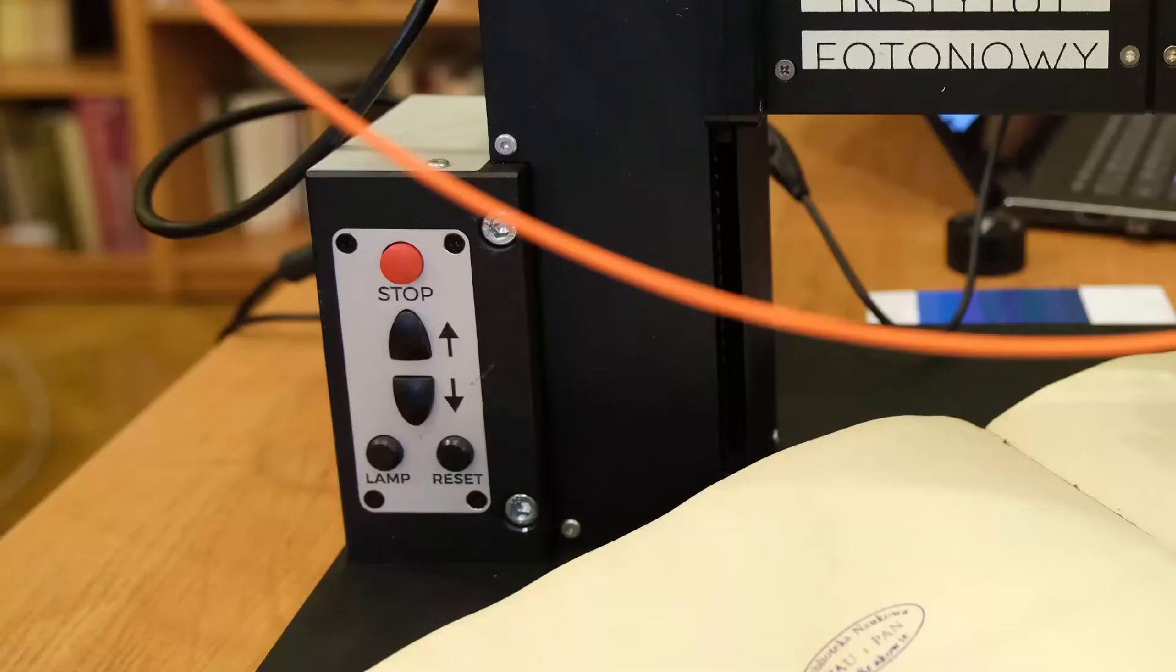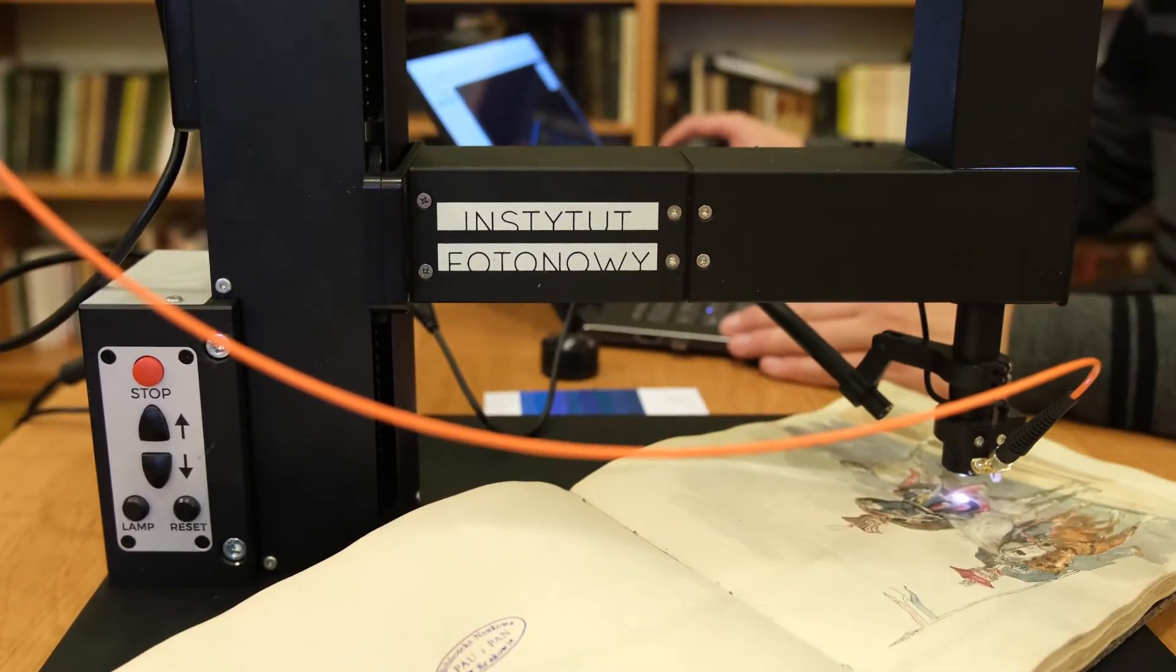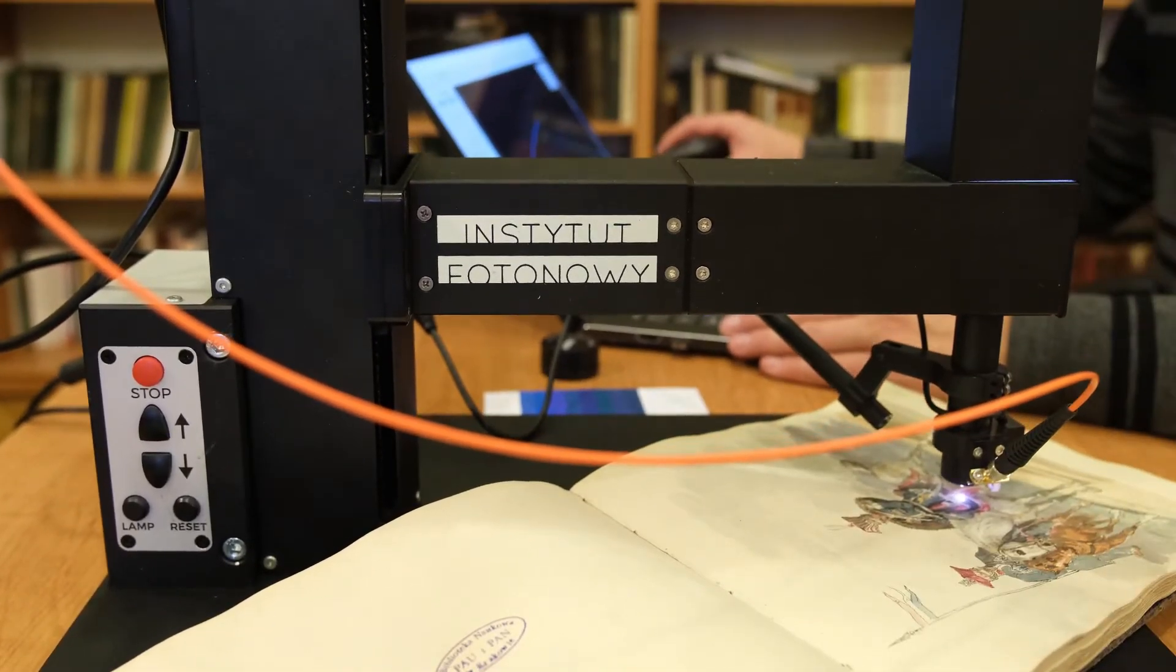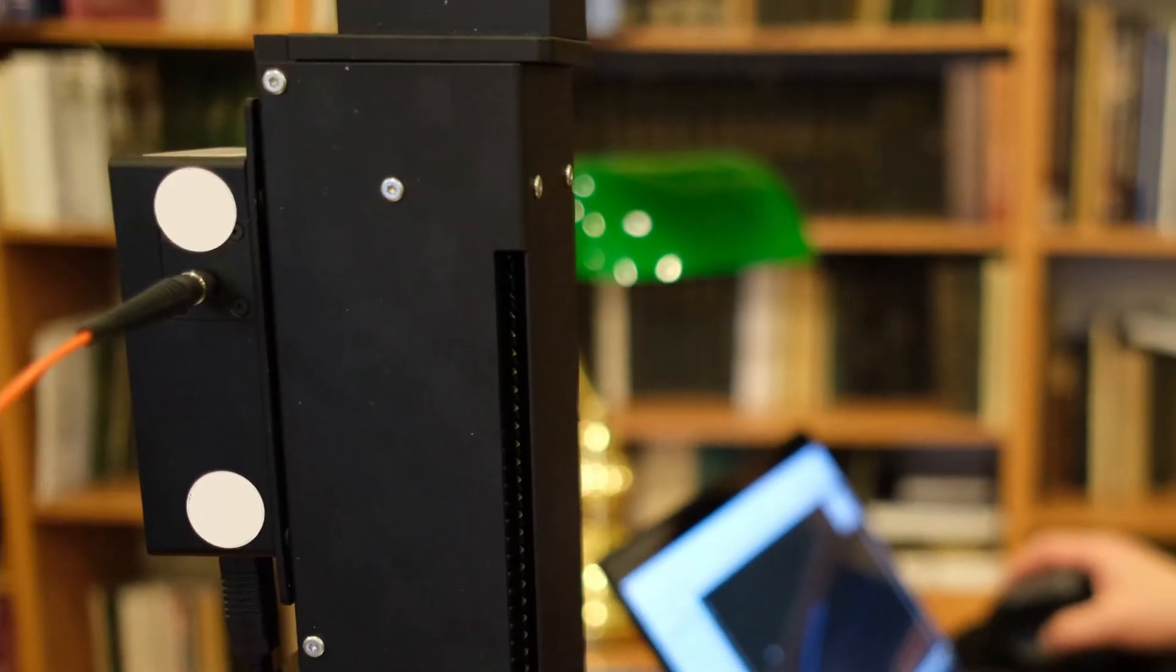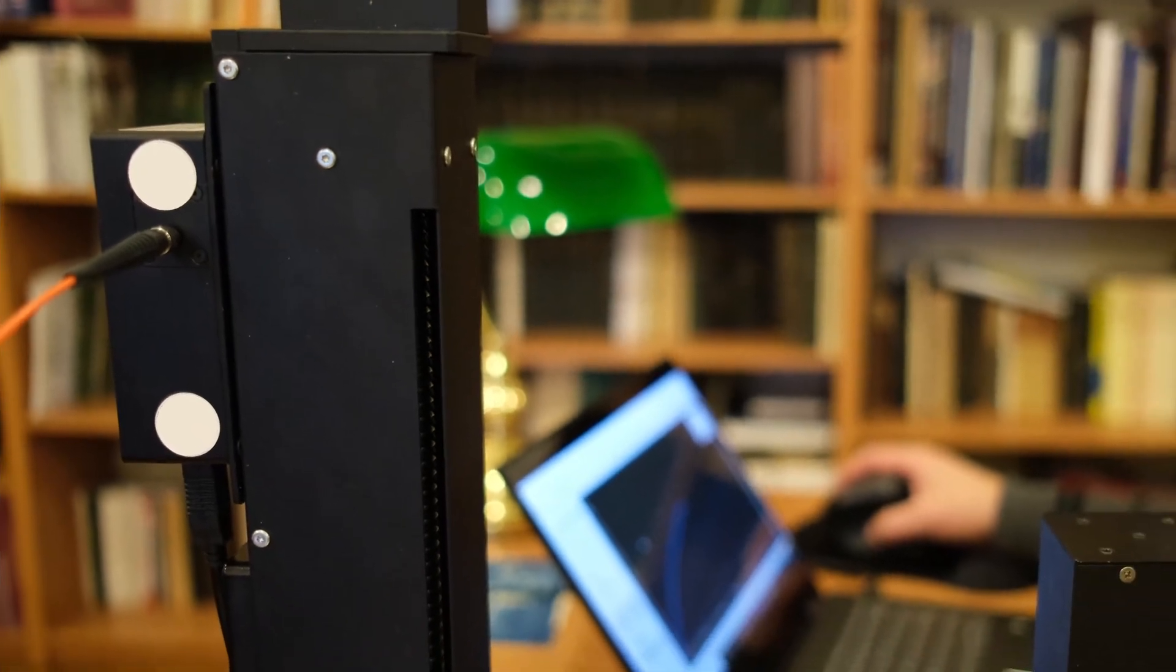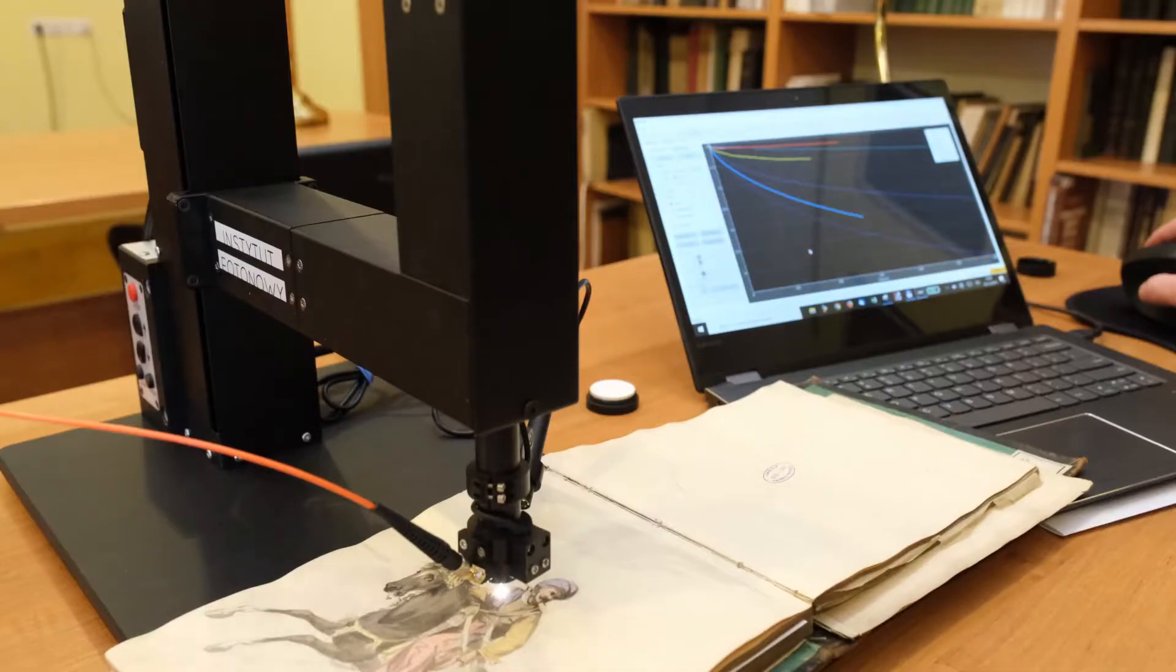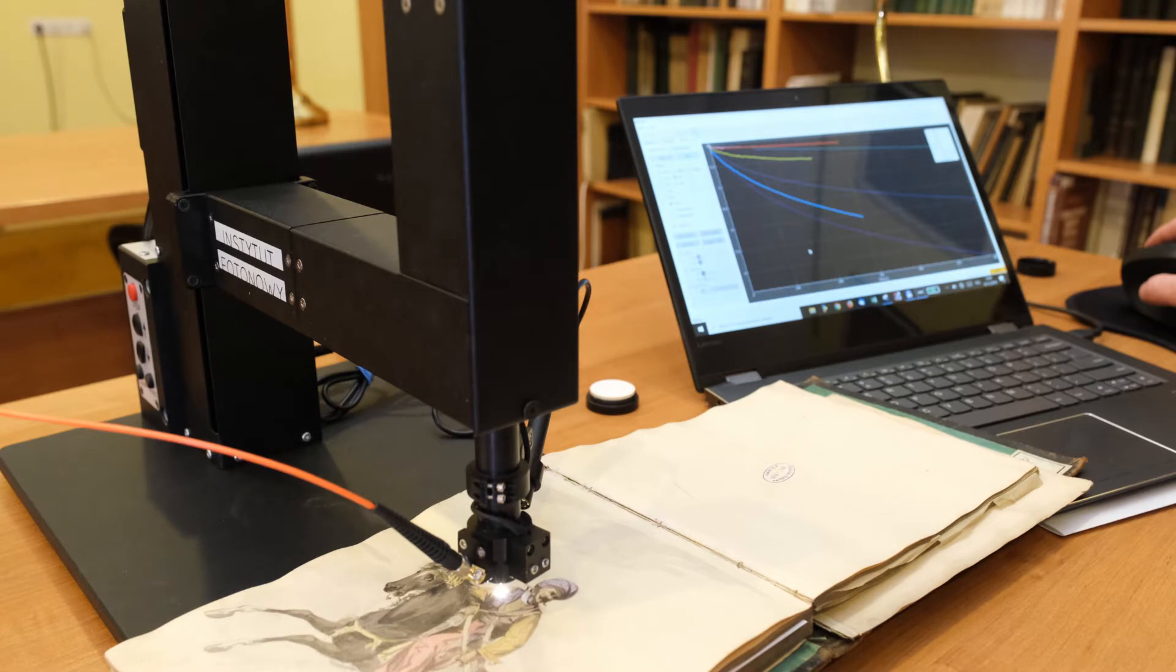Motorized mechanical drive controller for precise beam focusing. Spectrometer that collects reflected light spectra. And computer with user-friendly software that allows you to control the entire experiment.